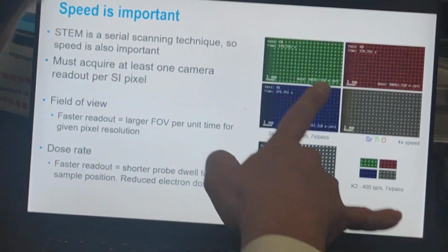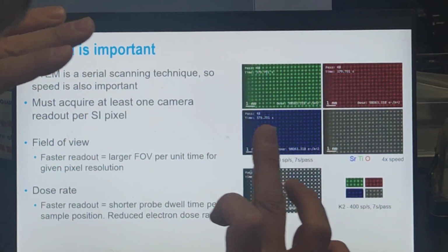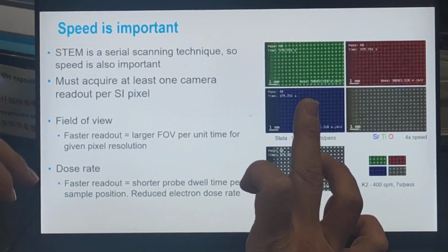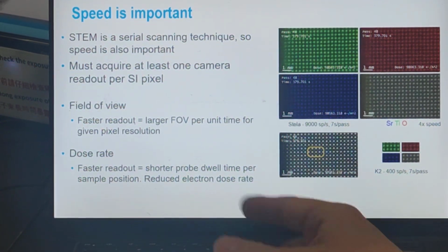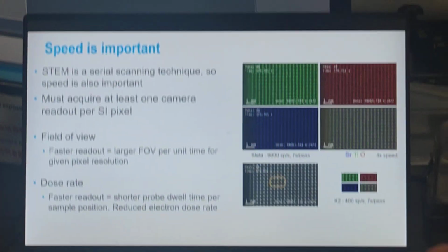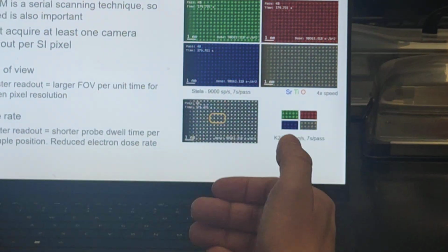Yeah. So what I do with these is there's a drift correction that's running live, and that's correcting. Because you've got the time series, you can check afterwards. Okay. So you can do a second drift. You can basically refine the spatial drift after you've acquired the data, because you have the time domain.